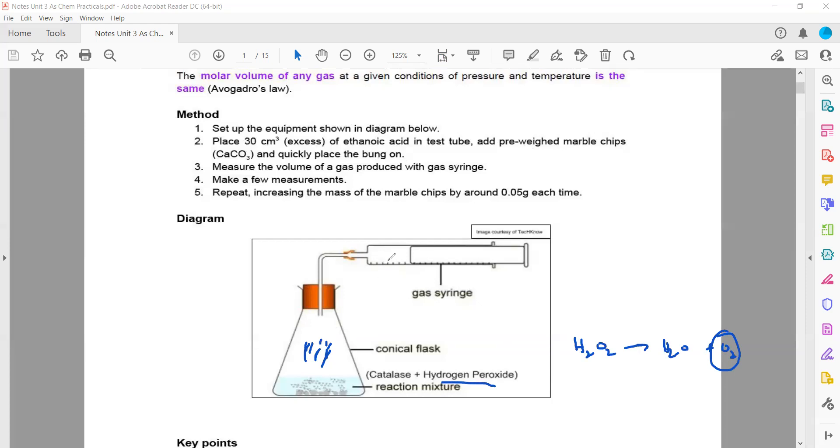Measure the volume of gas produced with a gas syringe. Make a few measurements and repeat, increasing the mass of marble chips by around 0.05 grams each time.